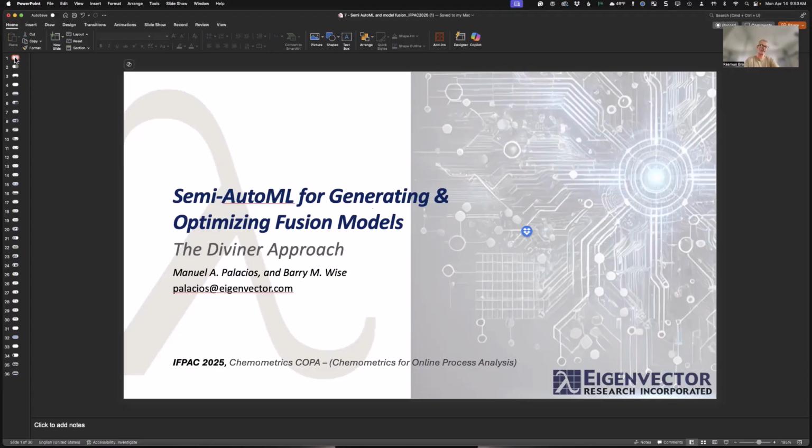We are baking a lot of things with Bayesian optimization, but it is not straightforward. And the problem with Bayesian optimization is that the response surfaces are all over the place. So it's really easy to find local minimums and get lost in there. And that's one of the things that has been extremely frustrating with using Bayesian optimization for preprocessing that are somewhat similar.